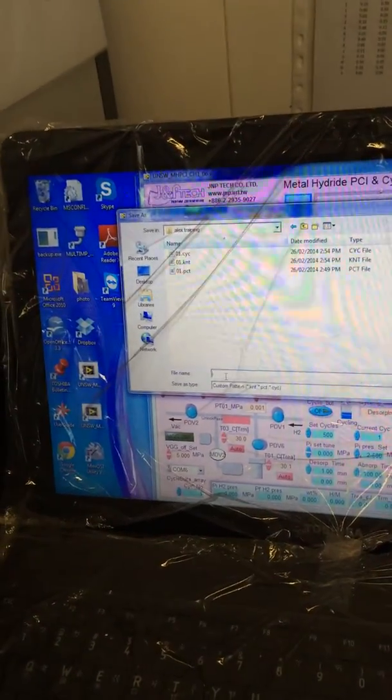You don't have to rename it because it will automatically rename with CYC. So just the same sample, right? It's up to you, but the kinetic file will be overridden. So there will be two files created every time you create a new file, whether it's a kinetics, a PCT, or a cycle CYC file. Kinetic files will always be created. A kinetic file is nothing, it's just recording your pressure, your time, and your temperature. So it's better.